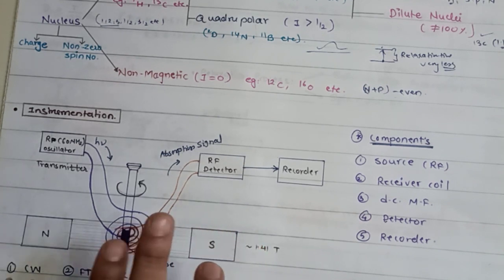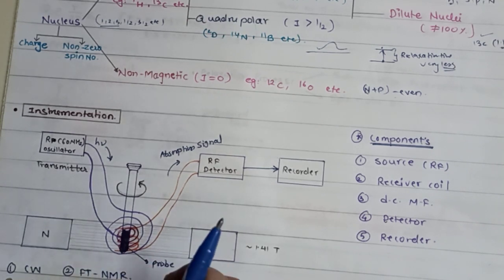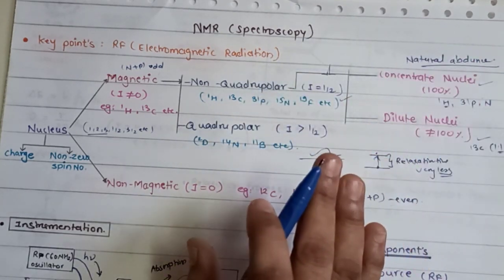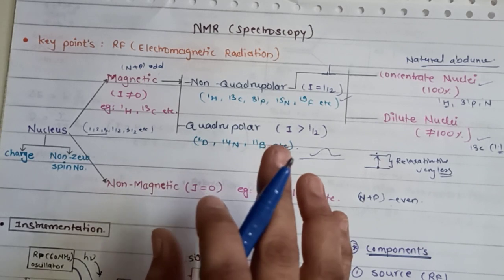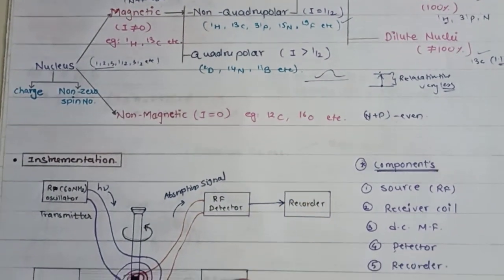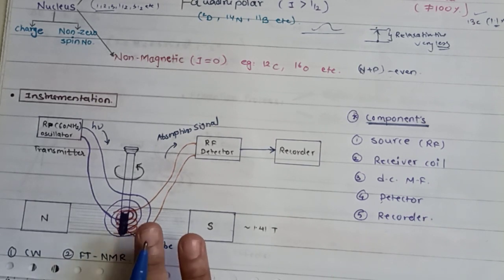The sample must be prepared using a high quality deuterium solvent. So generally, whichever solvent we select here, that solvent will basically be deuterium, because we do not want protons here, because in NMR spectroscopy we generally record the carbon and the proton spectrum. So if you record the carbon, then we call it a carbon NMR spectrum. If you record the proton, then we call it a proton NMR spectrum. So to avoid that proton peak, we take a deuterium solvent as the solvent.